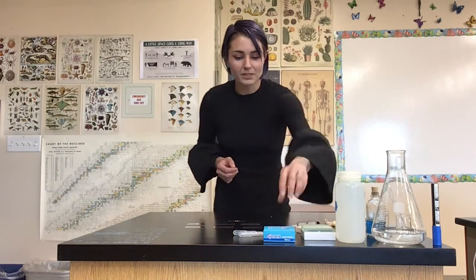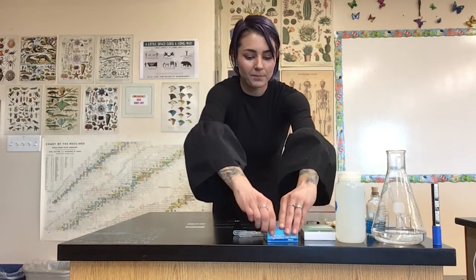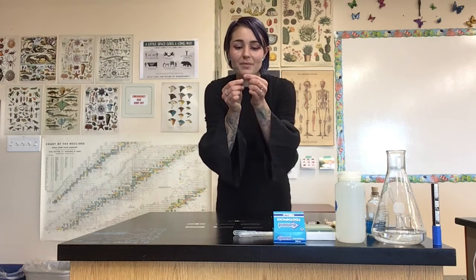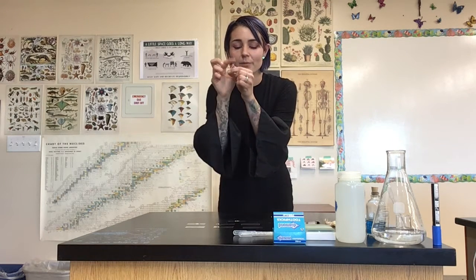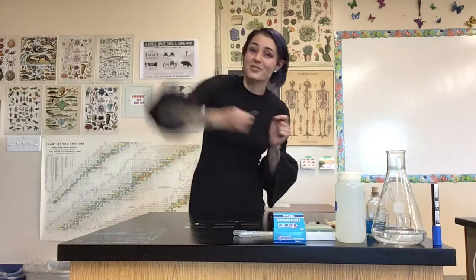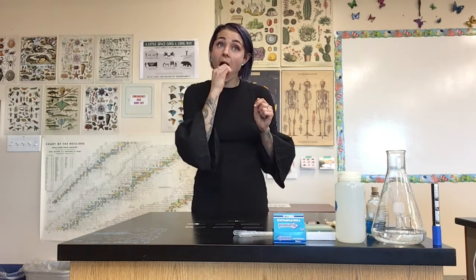So now what I'm going to do is use a toothpick in order to get some cheek cells for the cheek slide. So got my toothpick. These ones are nice, but one end is pointy and one end is blunt. That way I'm not going to stab myself in the cheek. And so what you do is you just gently scrape it. You don't want to try and gouge a hole. You just want to gently scrape. So that's what I'm going to do.